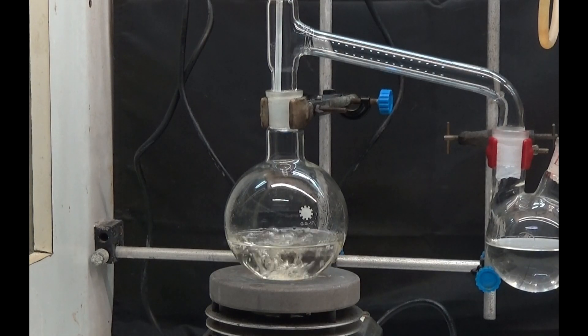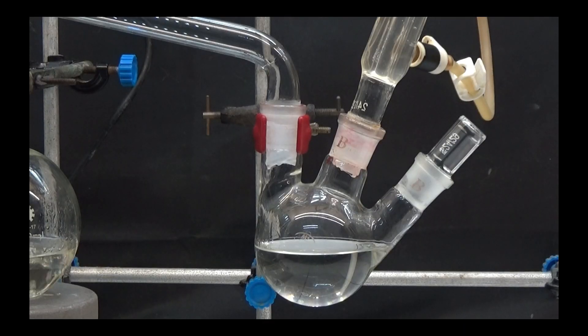First, we will heat the 500ml flask with a heat plate and distill most of the liquid. A significant amount of ammonia gas is produced during this distillation.